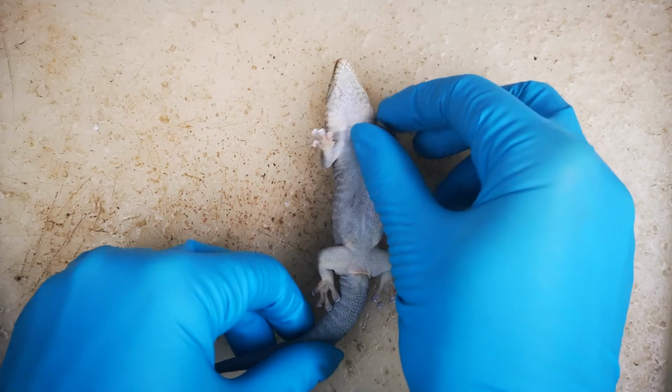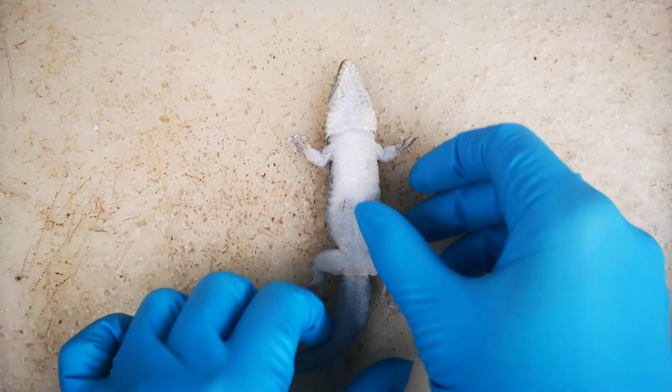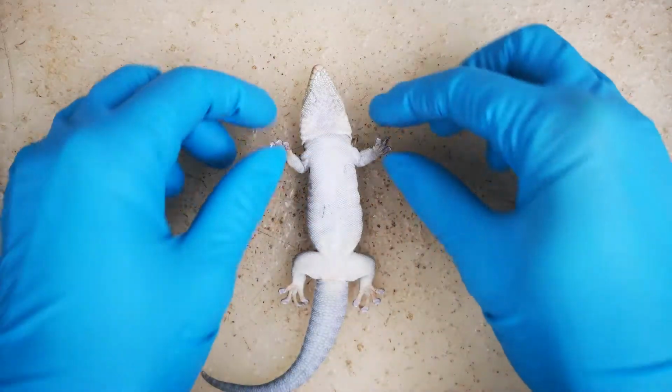To prepare the gecko specimen, we place it in the supine position in the dissecting tray. It is pinned in place with a pin through the tip of the tail and each limb.